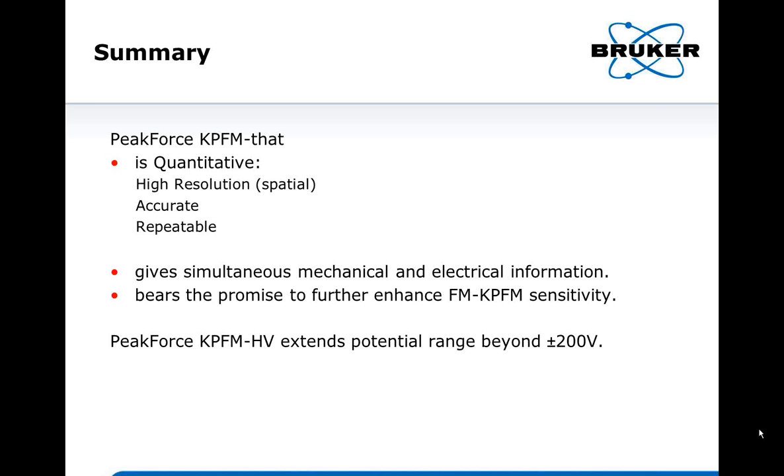For AM mode, the lever contribution can account for more than half. For frequency modulation, it accounts for much less. We are talking about really a few percent. So it's quite negligible.